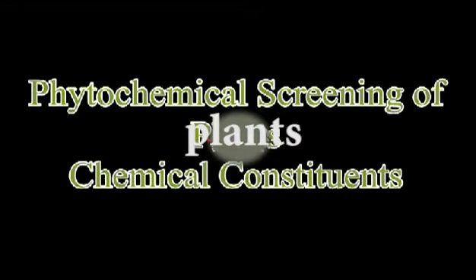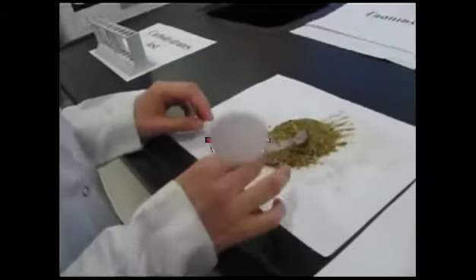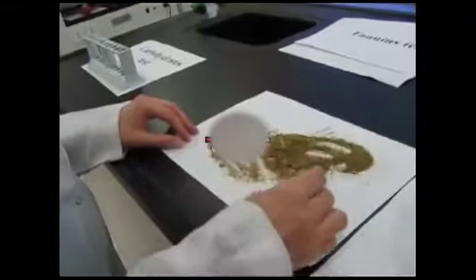Let's start with phytochemical screening of plants' chemical constituents. It's a chemical analysis process. First of all, we can test for several constituents: carbohydrates, glycosides, tannins, saponins. First of all, we will be separating this plant-based sample into three parts.